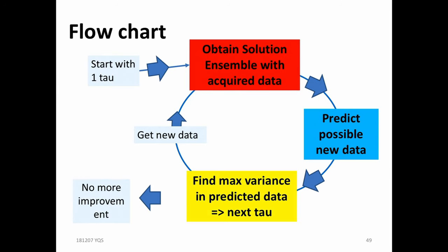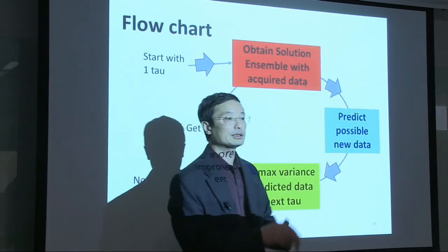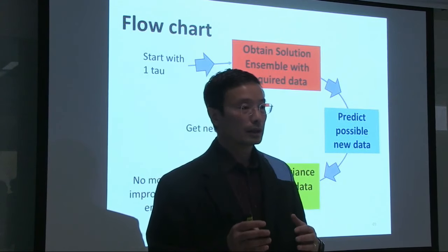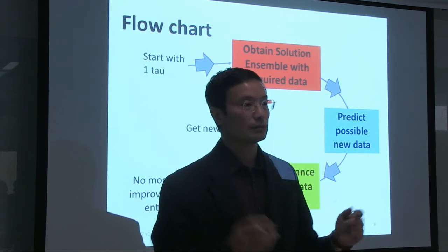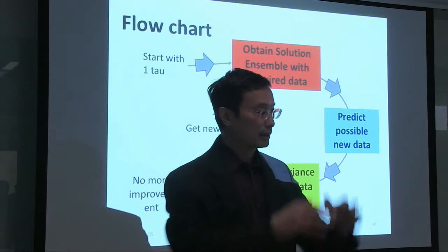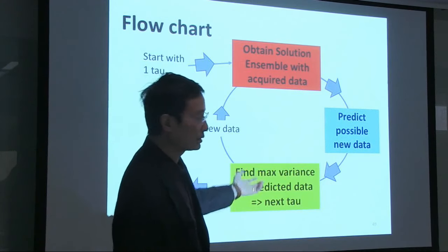Right. This is what we come up with. So you do some measurement, and what you want to do is you calculate the statistics of that one measurement. That is, what are the possibilities of the A and the T2? I call it a model, right? How many different models will fit to your data? And then you generate a lot, right? You generate, let's say, 1,000 or 10,000 possible models that are consistent with your data.